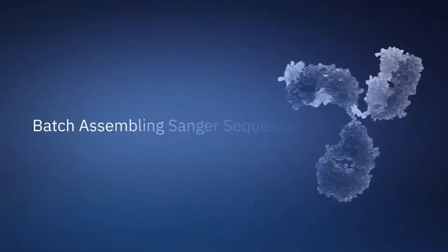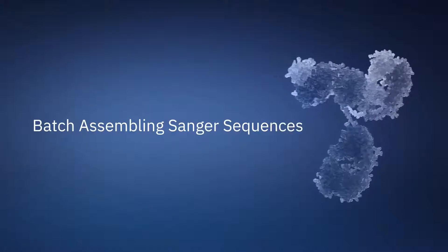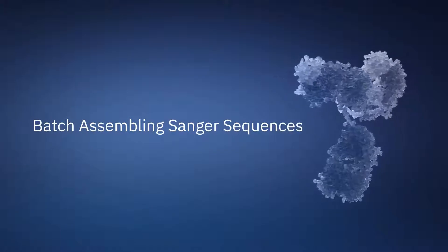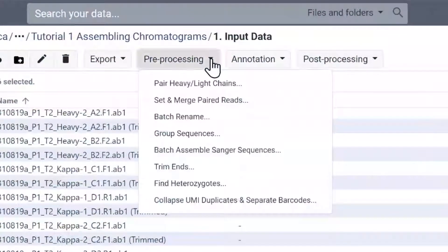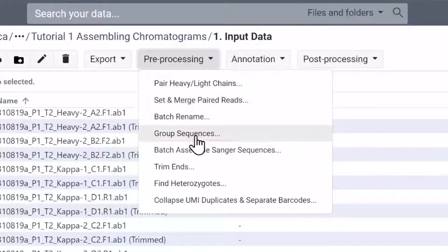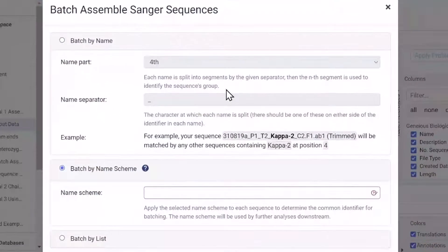Now, let's batch assemble the forward and reverse reads to form contig sequences. Select all the sequences, then select batch assemble Sanger sequences here.